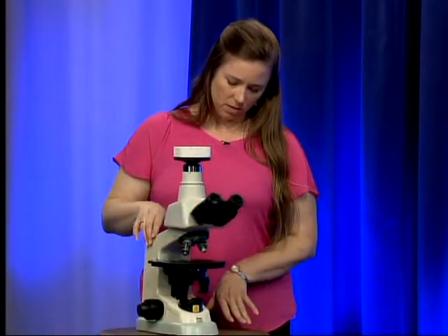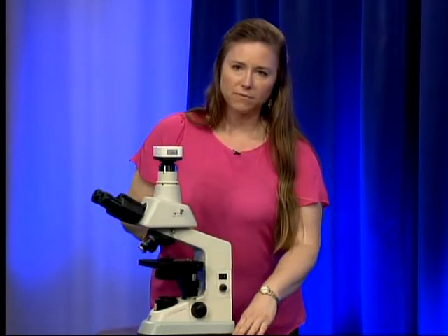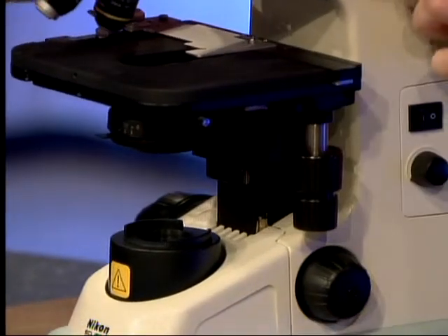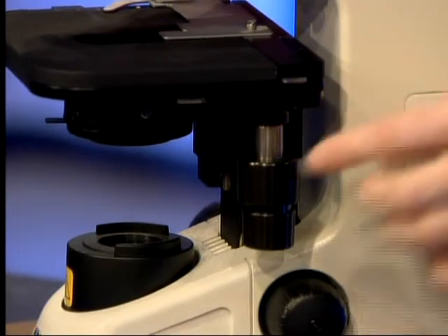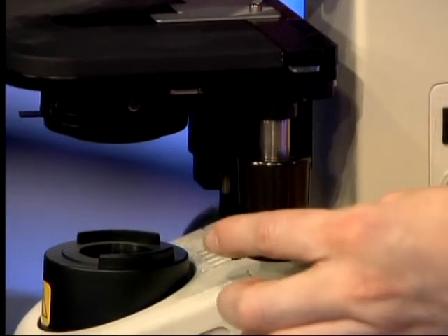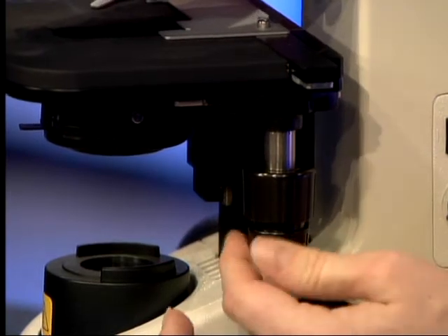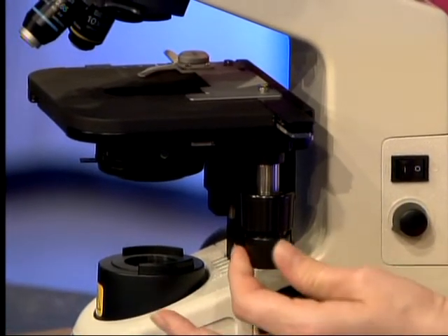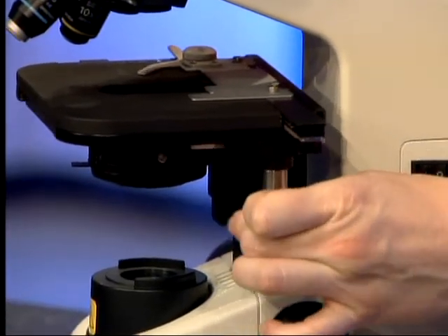On the right-hand side of the stage we have the travel knobs. These knobs help you move the slide around on the stage. Moving the bottom knob moves the slide holder left to right, and moving the top knob moves the whole stage front to back.